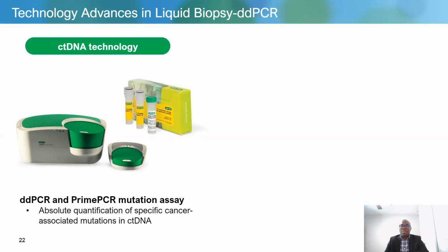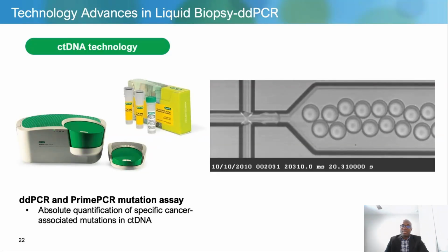An instrument that plays a pivotal role in analyzing ctDNA in liquid biopsy is the ddPCR, which stands for Digital Droplet PCR. ddPCR provides absolute quantification of nucleic acids with high sensitivity and precision. It excels in detecting low abundance targets, even in complex backgrounds and in the midst of PCR inhibitors. In blood, where cell-free DNA, ctDNA, and CTCs can exist at low levels, ddPCR sensitivity is extremely crucial.